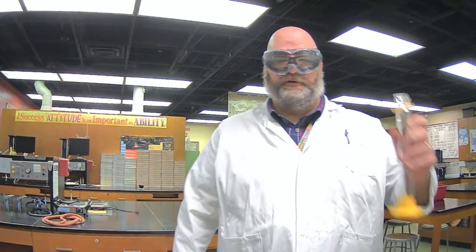So with water displacement, you're going to have two volumes. You're going to have the volume before the object is put in there, and the volume after the object is put into the graduated cylinder. Okay, so we're going to use a graduated cylinder.